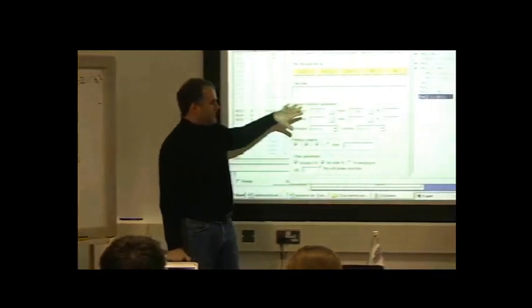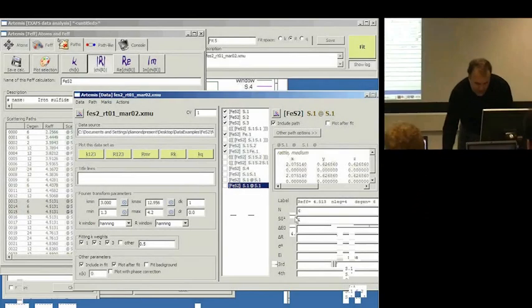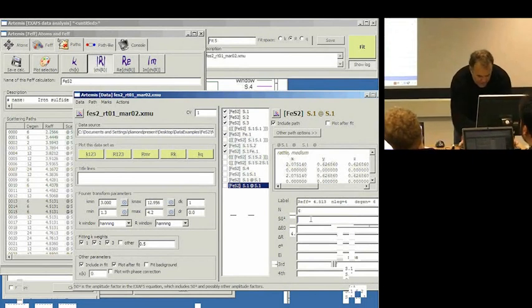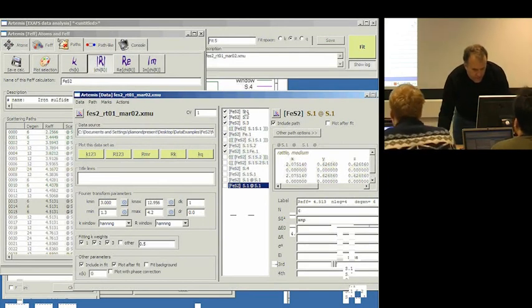So let me do a little bit of typing really quickly. So we needed amp and E naught. In fact, this typing is going to drive me crazy. So let me unmark all, mark the three paths I just put in.